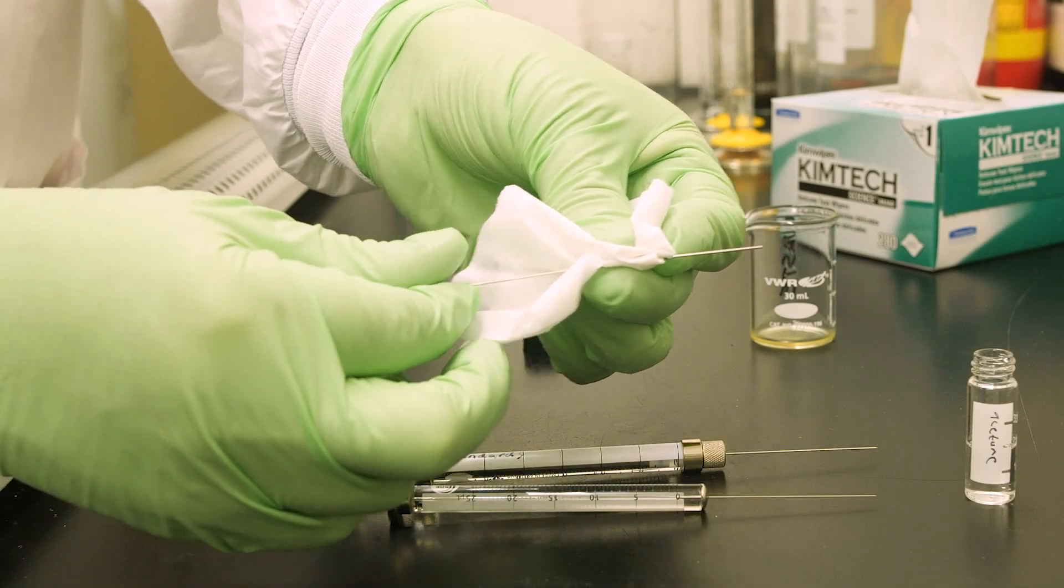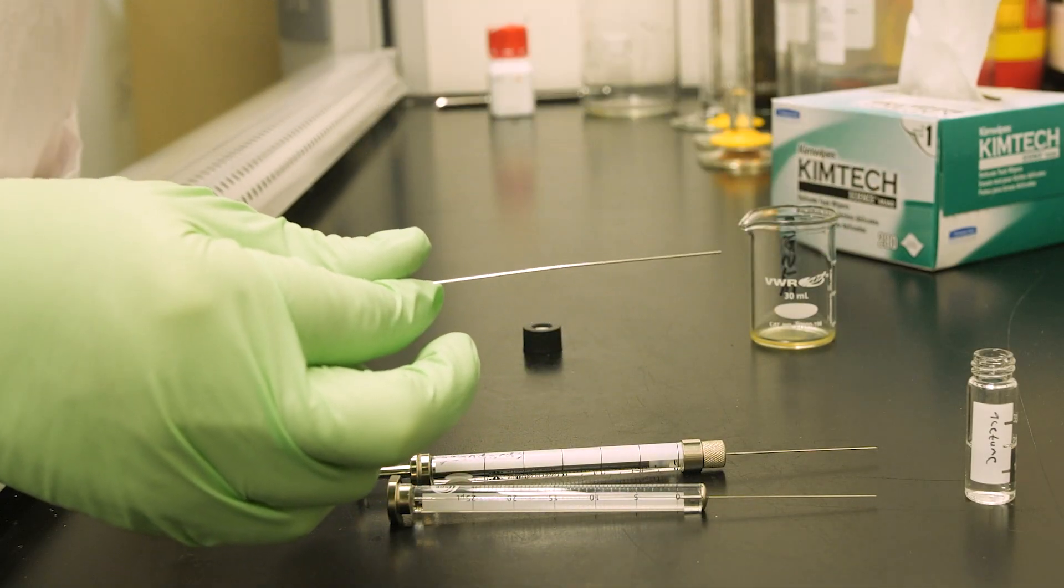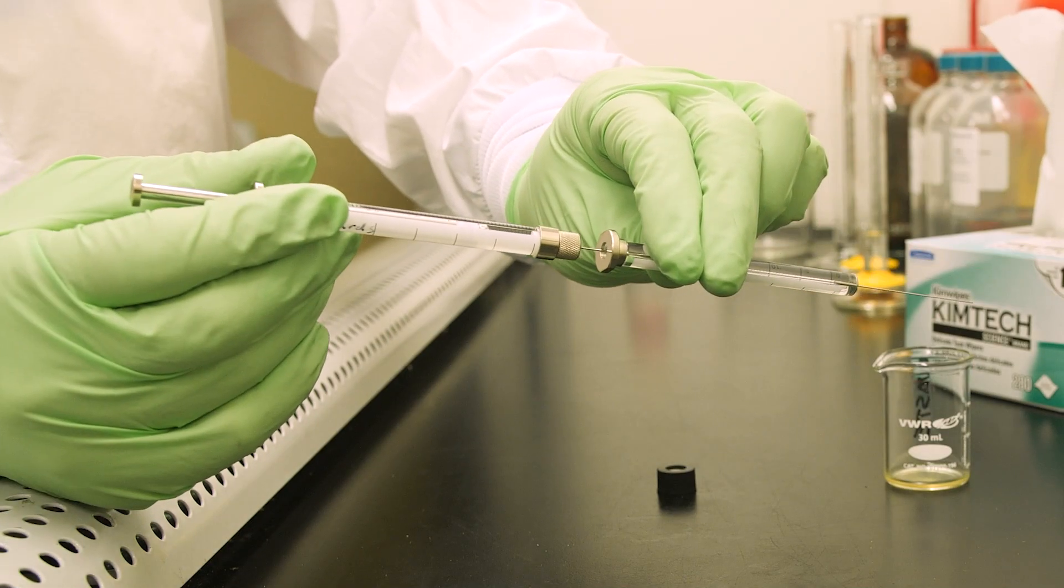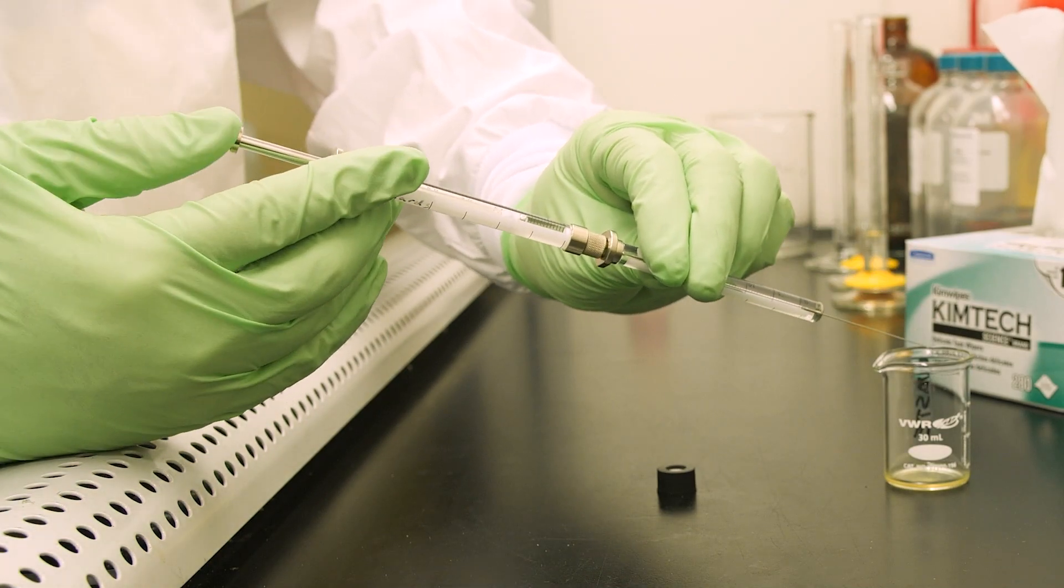For debris, remove the plunger from the barrel and clean the plunger with a wipe dampened with solvent. Then flush the barrel with solvent using a second syringe to ensure all the debris has been cleared.